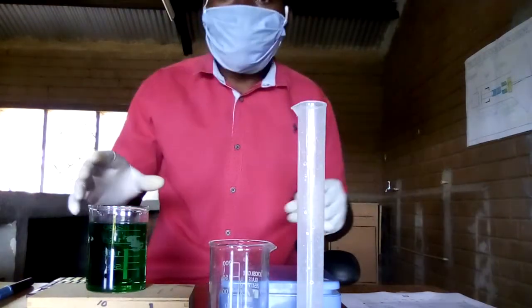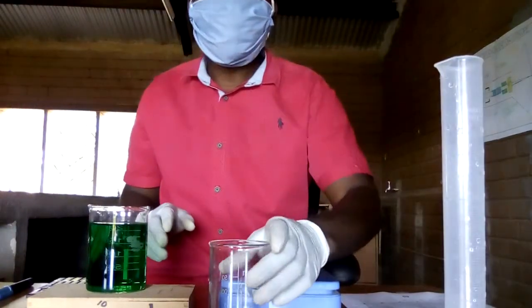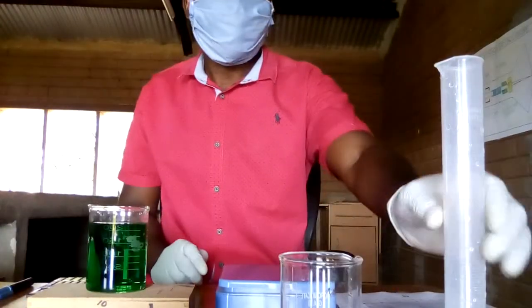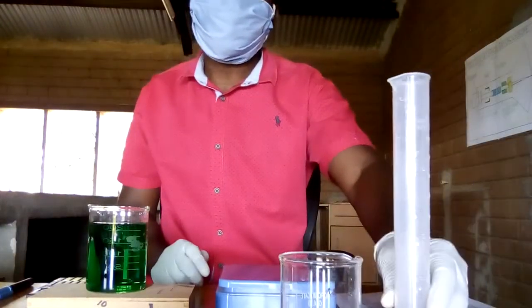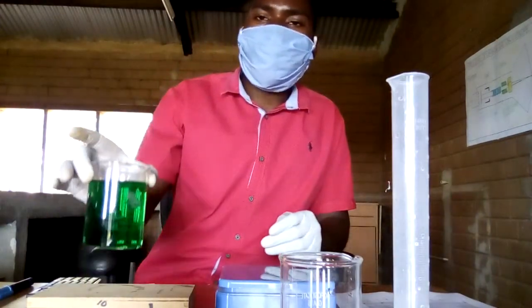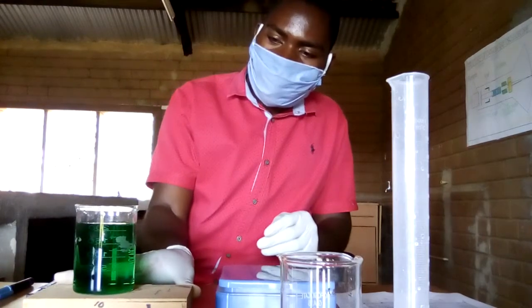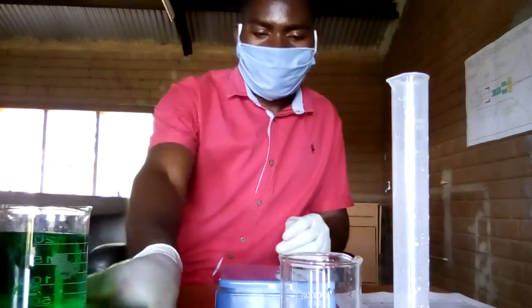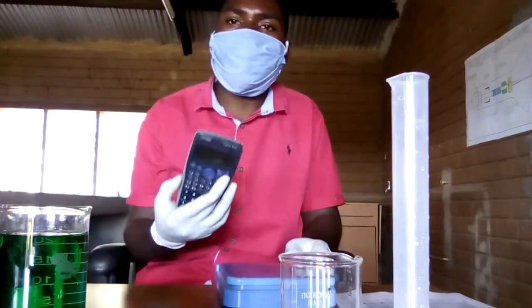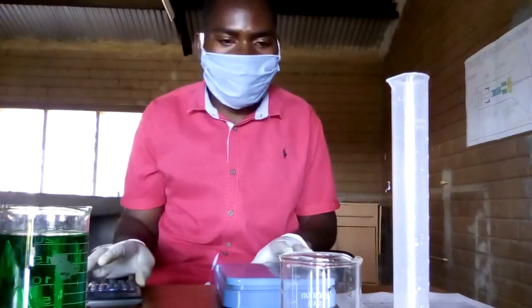So in my demonstration today, as I've already alluded to, we have to be provided with the empty beaker, the measuring cylinder which is calibrated at 100 mils, the volume of the unknown liquid, and also the apparatus. Remember, you should also have a calculator with you, as well as a rule and a pencil.